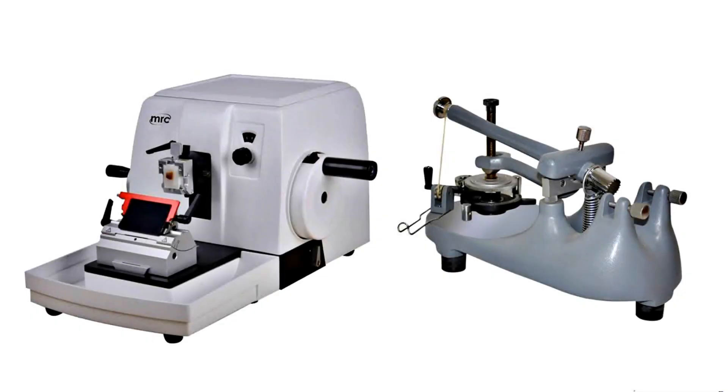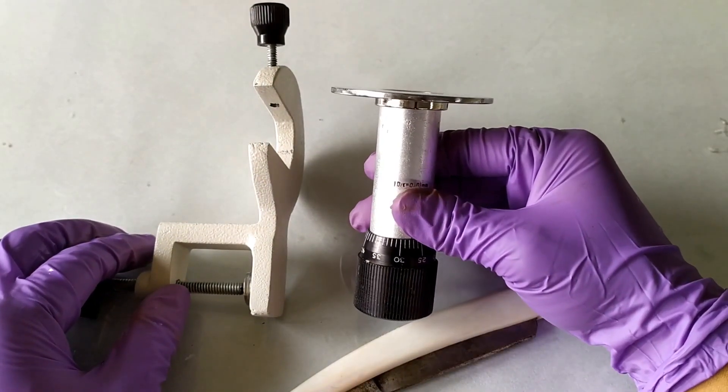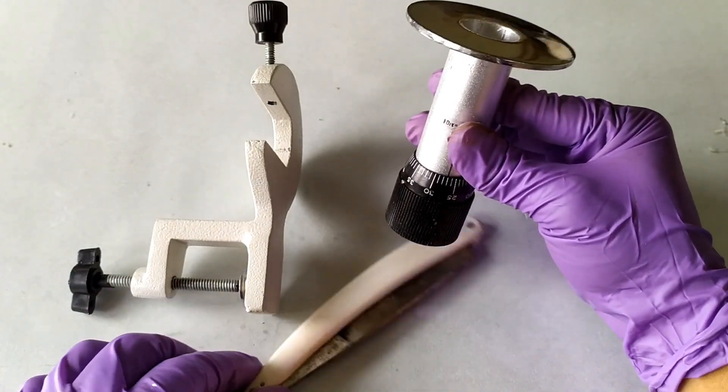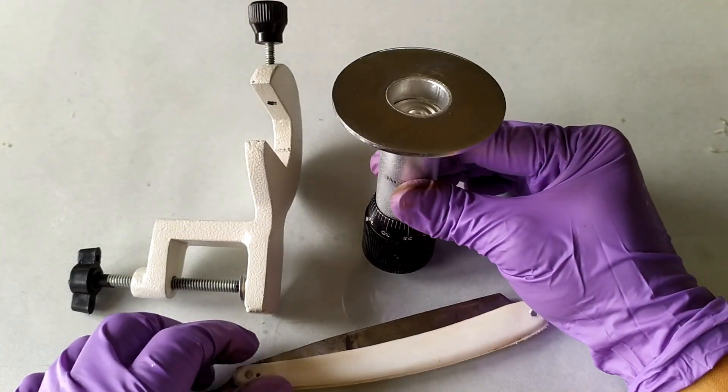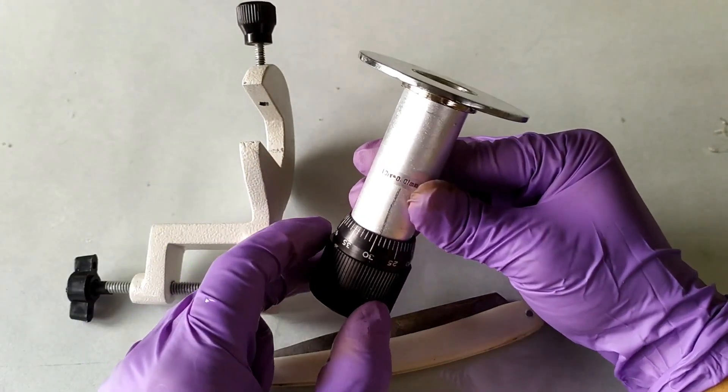Compared to the traditional bench top microtome that requires the specimen to be chemically processed and then embedded in a wax block for sectioning, the hand microtome can produce thin enough sections quickly and without the need for any sample pre-treatment. In fact, the hand microtome works best with fresh plant materials, which may or may not be embedded in a pith material.